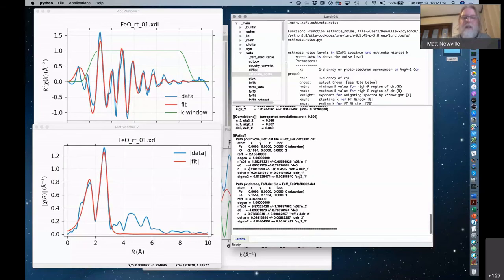The distances got better, but they're still a little on the short side. Again, I don't know if all of the iron oxygen data, all the wüstite data I ever measured has some hematite in it, but I always get a shorter distance than 2.14. We've measured this many samples.